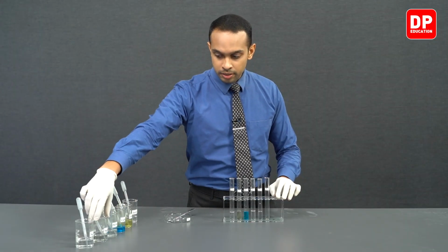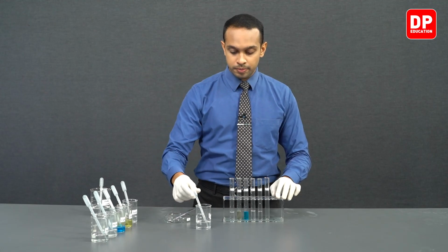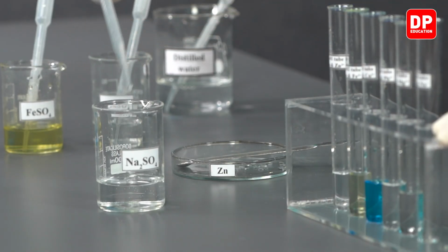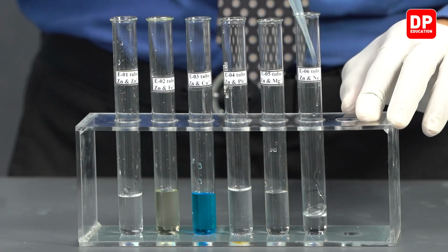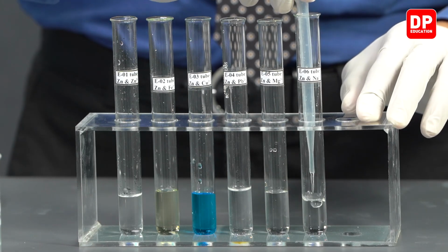And finally, to our E6 test tube, we will add our sodium sulfate solution.